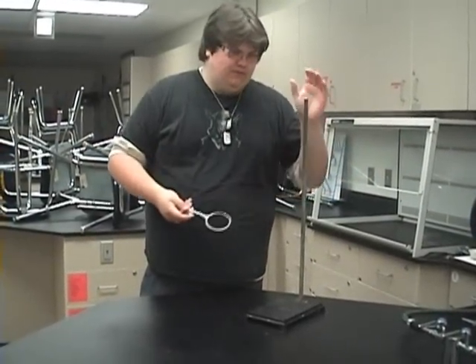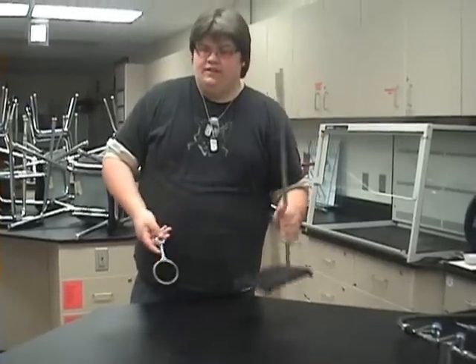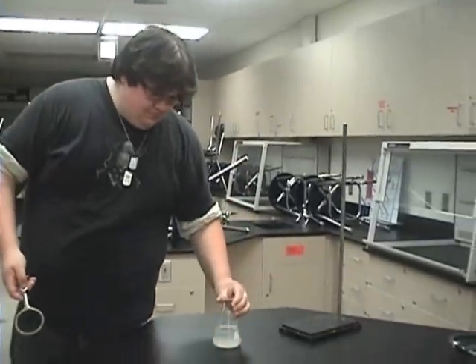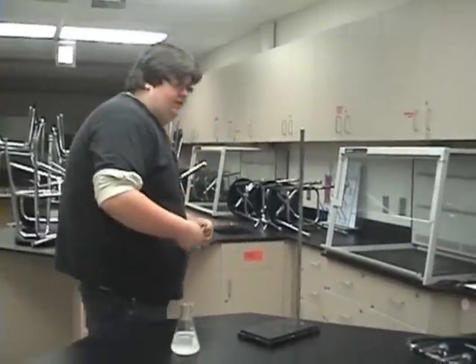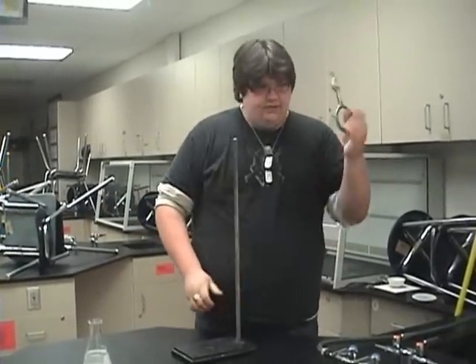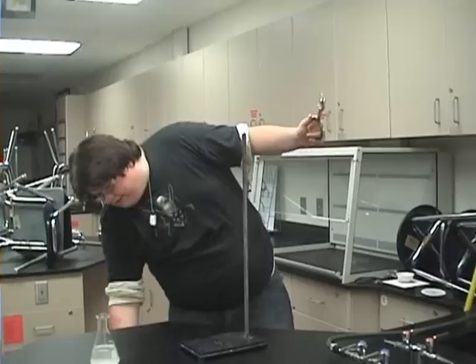Here we are going to set up this thing and then we are going to learn how to evaporate the salt solution. First you get this thing out of the cabinet down there, and you get this thing out of this cabinet down here.